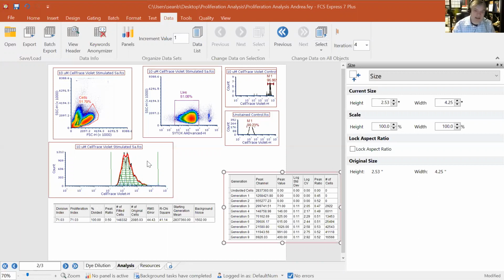When you're setting up for these types of assays, you're generally not coming in here and just running the assay one time and praying that it works, because again, it's a very technically challenging assay to run. So as you're running this assay and developing it and setting it up, you can get an idea of how many events you're going to need. And if you ran it and the results looked wonky, and you need to rerun the assay next time, well, maybe you go in and you double the amount of cells that you're working with.